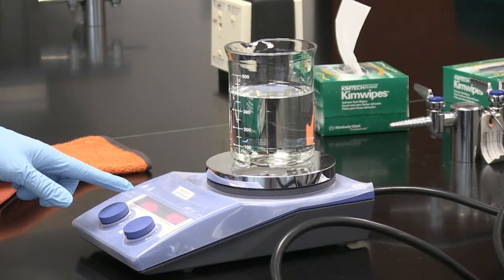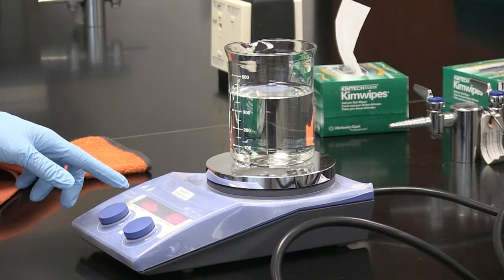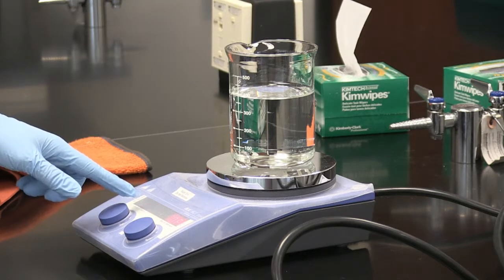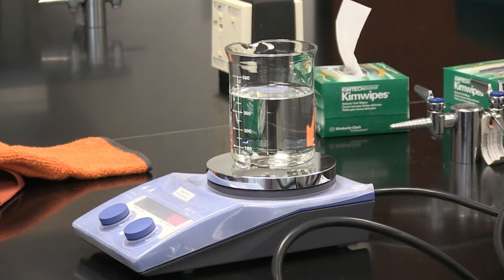If you notice, this hot plate, once it's on, is going to show that it's hot. This gives an idea that you have to be careful.